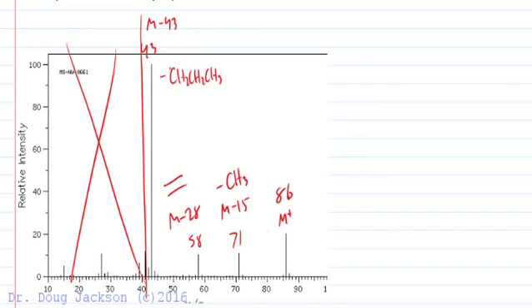But that's how we diagram. Find the molecular ion, label the fragment masses. See these little ones here. They're not the highest in the group. We only care about the highest mass in the group in the high range of the spectrum. So we're analyzed and we're ready to go.